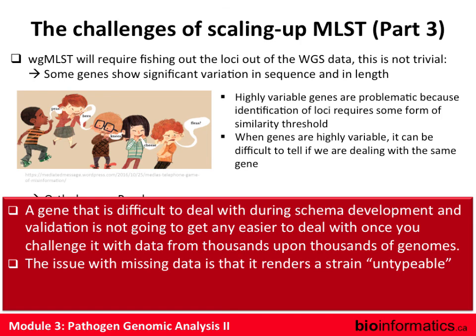Anyway, the problem with missing data, in this whole thing about accessory genes versus genes and gaps, is that as far as MLST is concerned, if we can't figure out what the sequence is, we can't type that. So for all intents and purposes, missing data is our nemesis. We can't assign its true sequence type, only part of it.